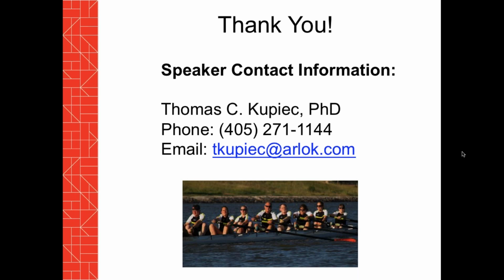There's a lot of questions here. What is the minimum volume considered large volume parenteral?